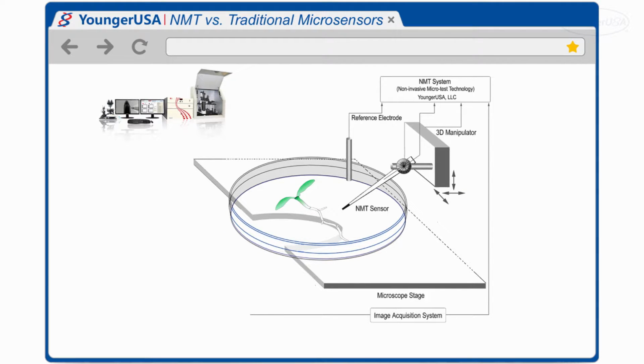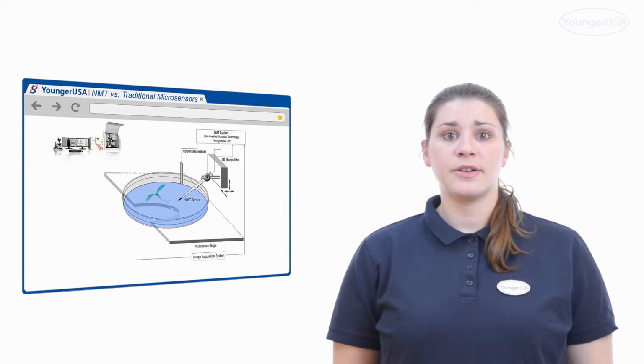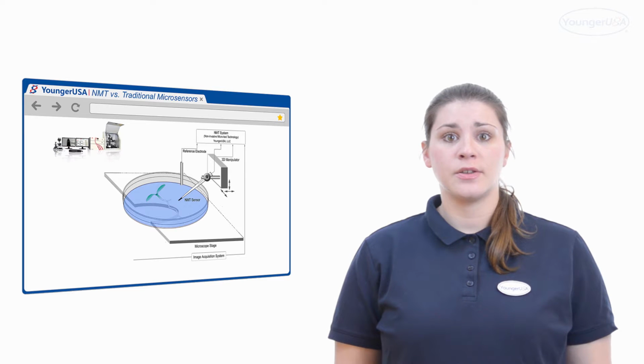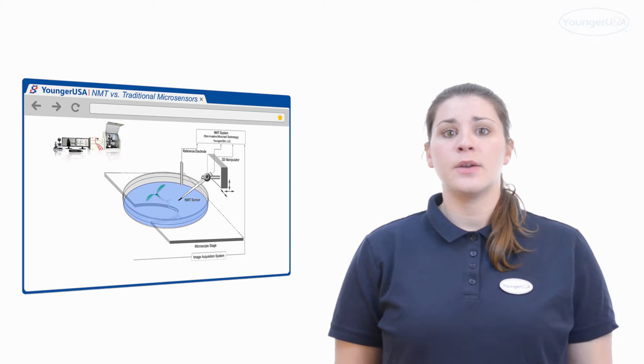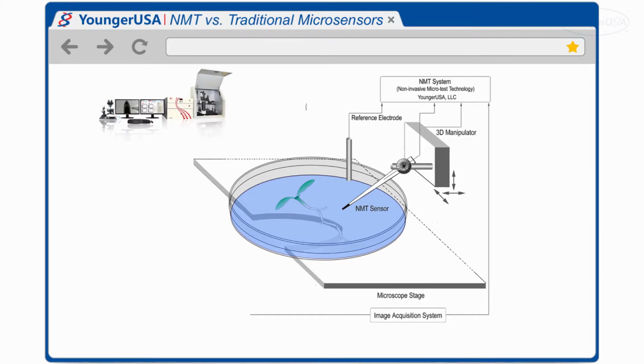It is important to remember that in order to measure ionic and molecular fluxes, samples need to be in a liquid media environment. You may be wondering if this affects the accuracy of a sample that isn't naturally found in a liquid environment. Well, the media added should reflect as closely as possible the sample's real-life environment. So even though the Arabidopsis seedling isn't in soil, it will still behave as closely as it would in its natural soil environment. Now, the light source and microscope collect the information of the image while measurements are taken.